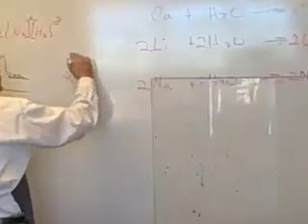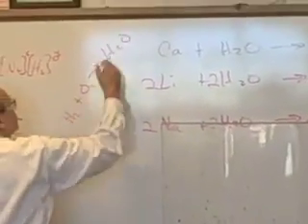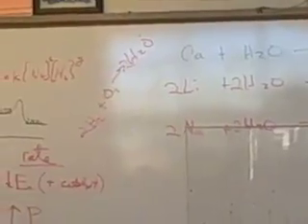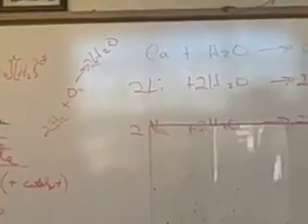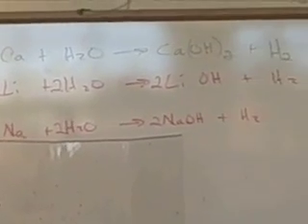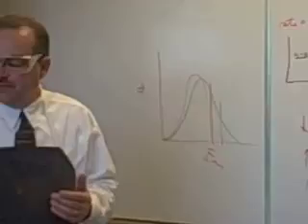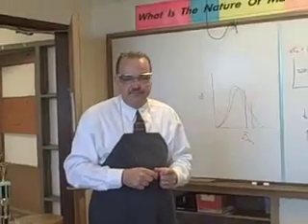All of this fire comes from this. That's a reaction. So what happened is some hydrogen accumulated in the sodium. It was producing it pretty fast. It's covered with oil anyways. You get a little bubble of hydrogen formed and all the hydrogen blew up at once. So the explosion we saw was a hydrogen explosion. It wasn't a sodium explosion. The sodium is just creating the hydrogen very quickly because it reacts with the water fast.